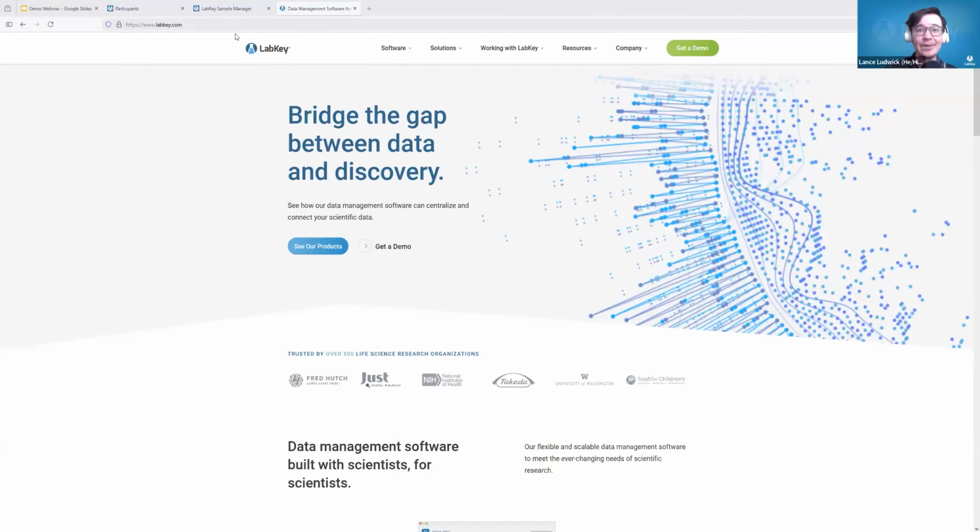So some questions that we usually get is how is the data stored within Sample Manager and what are the IT burdens behind it? So Sample Manager is all hosted in the cloud. We maintain it through monthly updates with both maintenance and new features. So we really heavily reduce any of that IT burden of having to maintain that system. We can make sure that you don't struggle with any of that, and it can help reduce any overhead that you have there.